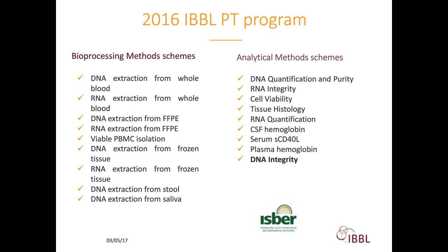CSF hemoglobin measurement, serum CD40 ligand measurement, plasma hemoglobin measurement, and one of the schemes that will be soon integrated in the future is a specific analytical scheme for DNA integrity number measurement.